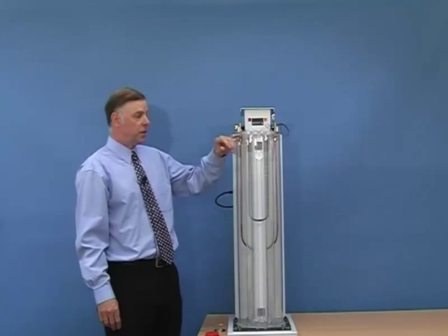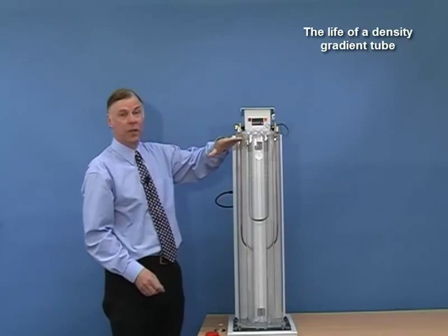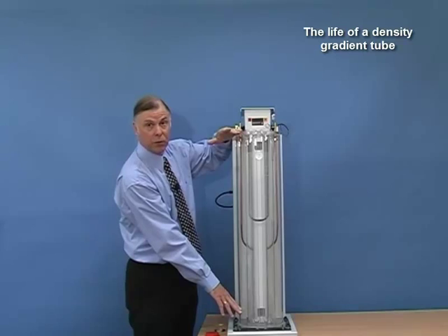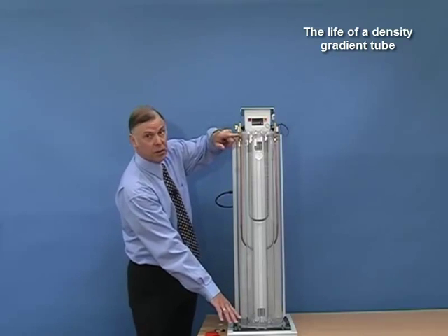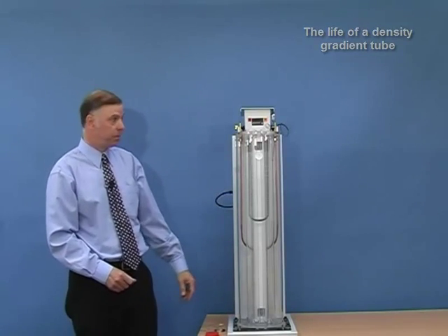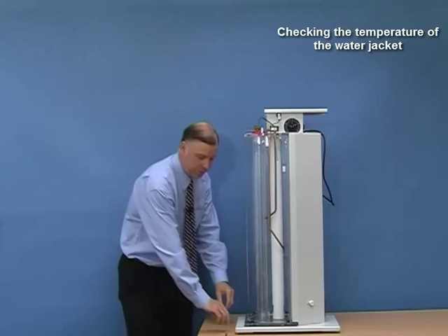Typical life of a density gradient tube is about six weeks. What will happen is the liquids will very slowly mix together, so the low density which was 0.9 will gradually increase to say 0.91, and the higher density of 0.95 will gradually reduce to 0.94. So the two outer floats will start to reach the edges of the tube. When the floats reach the top or the bottom of the tube, then you have to replace the liquids. The water jacket has to be maintained at a constant 23 degrees centigrade, plus or minus 0.1 degrees, and the thermometer supplied has graduations of 0.1 degrees. The top of the thermometer has a step and when it is lowered into the instrument it will sit in position.